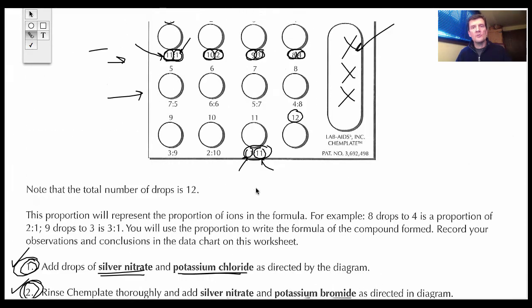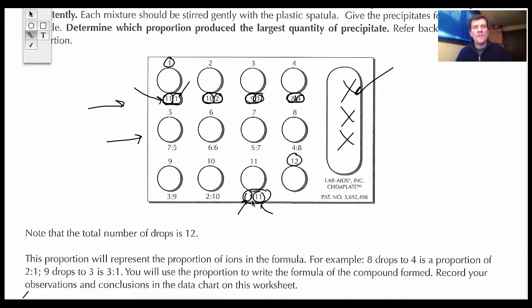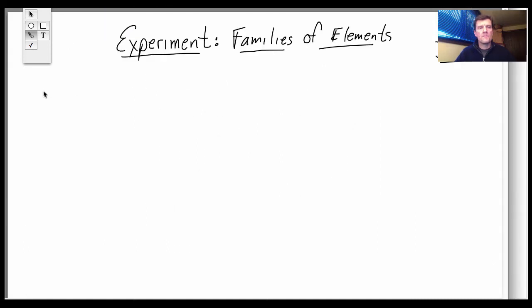So what you will do is, on your lab report, I'd like you to draw this diagram right here. Now normally in a lab report you would have your title, this is your title by the way. Then we might have materials, and I'm not going to ask you to write the materials down, I'm just letting you know, a list of materials. And then we would also have a procedure, step by step, what we're doing. I'm not going to ask you to write that down.